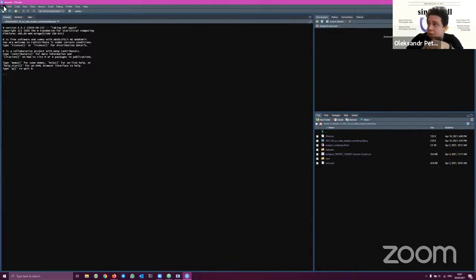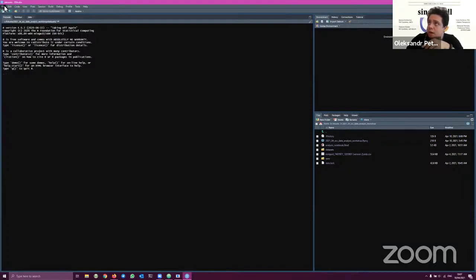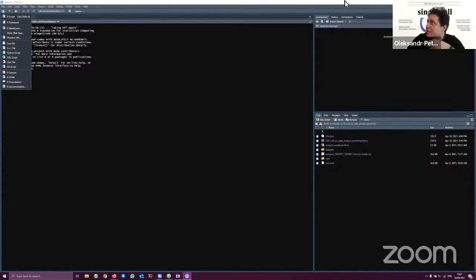The second step we should all do, if you work with RStudio on your own laptop, is under the File button, there is a small file with the plus button. You should press it and choose R Markdown, the third option. Okay, so I will just do something with my hand because I see that I raised the hand, but I obviously don't want to. All right, so we should create the R notebook because this will be our working environment.